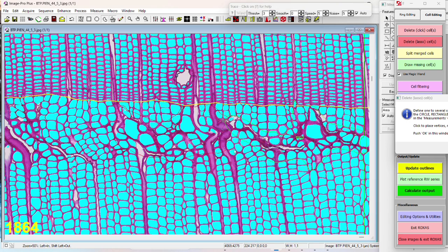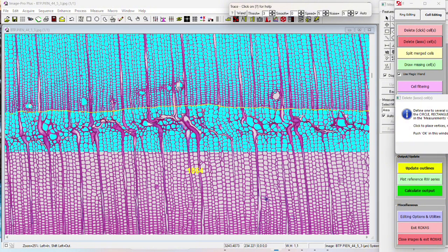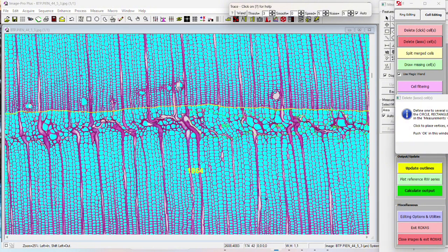That could also be because of the frost ring, but it's just random ones out of nowhere that do that, and I thought that was interesting. So yeah, you just do this across the whole ring. It does sometimes turn into taking out an entire section of a ring. That's unfortunate, but that's just something that we have to do sometimes to get rid of these anomalies.